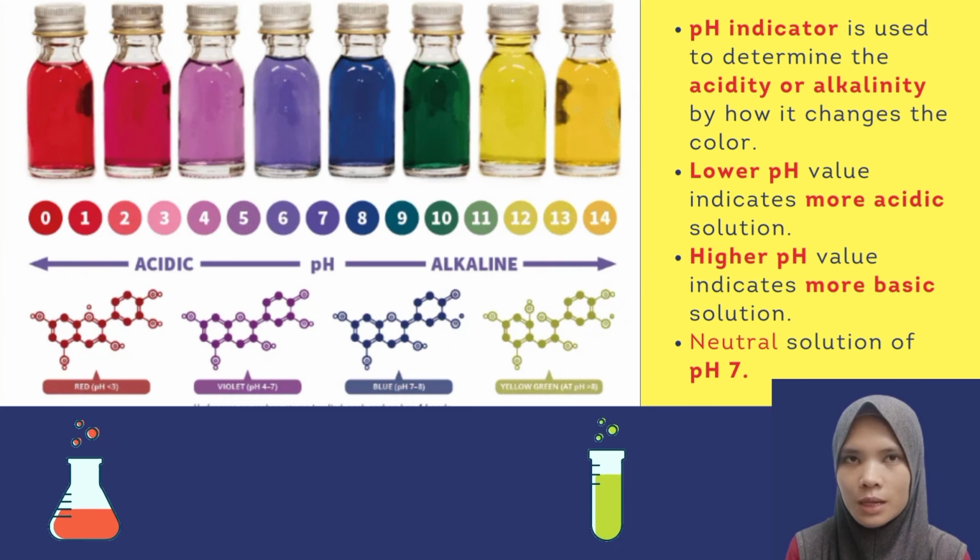While for an unknown chemical, a pH indicator is used to change color. A pH indicator is a substance that, when a small amount of it is added to a solution of unknown pH, will change its color. This is a way to determine the pH of a solution visually. The indicator used in this experiment is obtained from a natural source, red cabbage. Cabbage indicator produces a particular color depending on the pH of the solution.